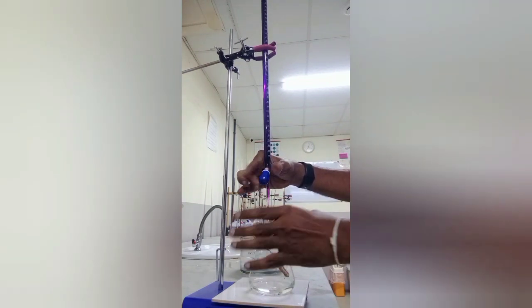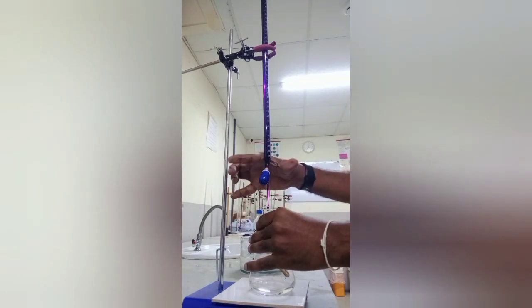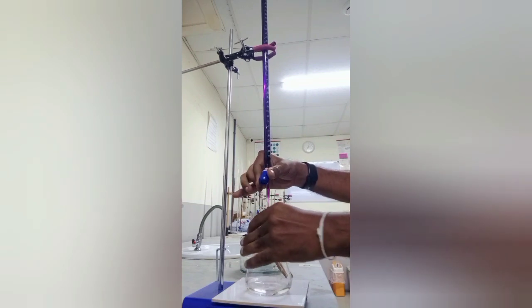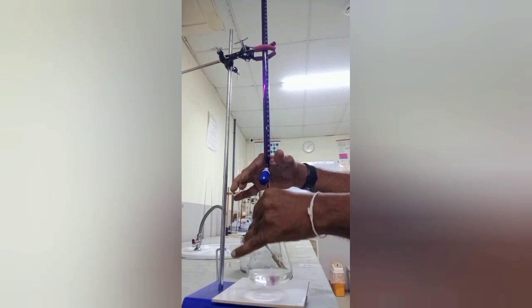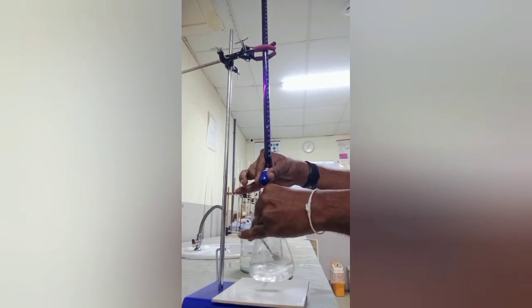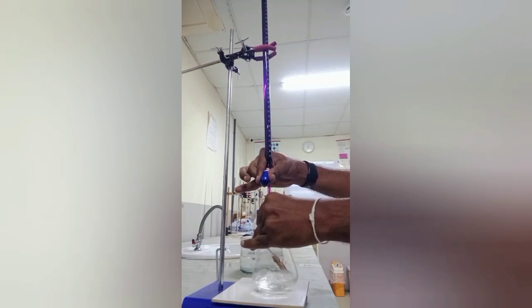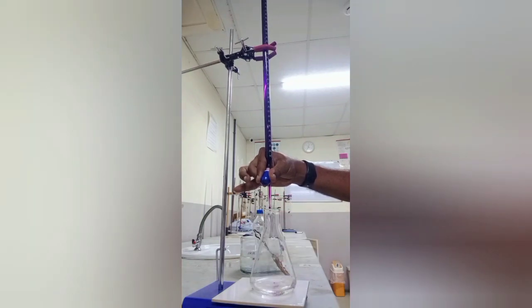So every time, right hand on the conical flask, left hand on the knob. Only these 2 fingers you want to use on the knob. Just bring it under control. It has to go straight. Then you can rotate the conical flask while adding KMnO4 dropwise. Drop by drop. You can make the drops fast, that is not a problem, but it should be in drops. It's not supposed to be in free flow.